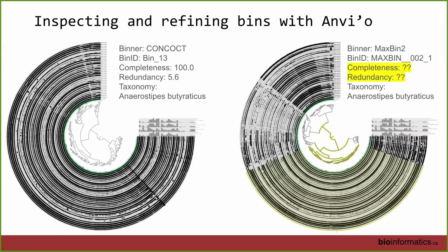This is what you have to be prepared for, is you should never just publish bins. If you're gonna publish a bin, you need to look at it and refine it. There's far too many bins out there in these huge collections, and so many of them are crap. It's really a shame because it misleads our ability. Like, we can't download that data and then use it. We have to go through all this rigmarole to make sure that it's quality. Go ahead, sorry.